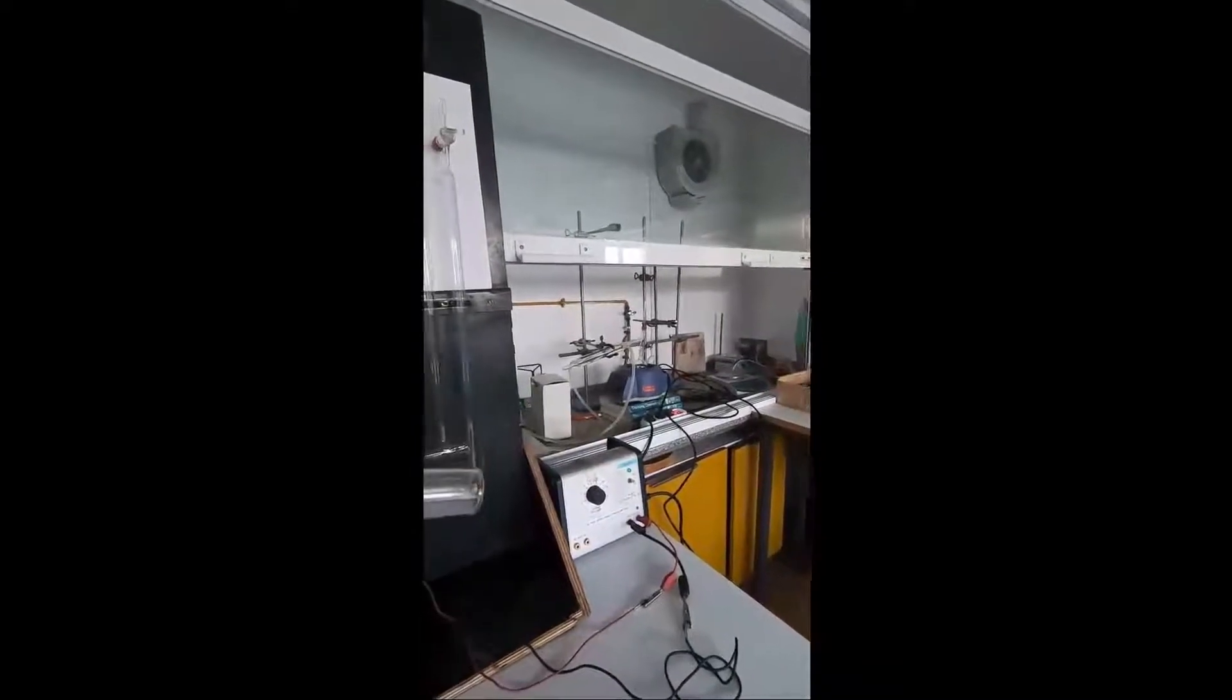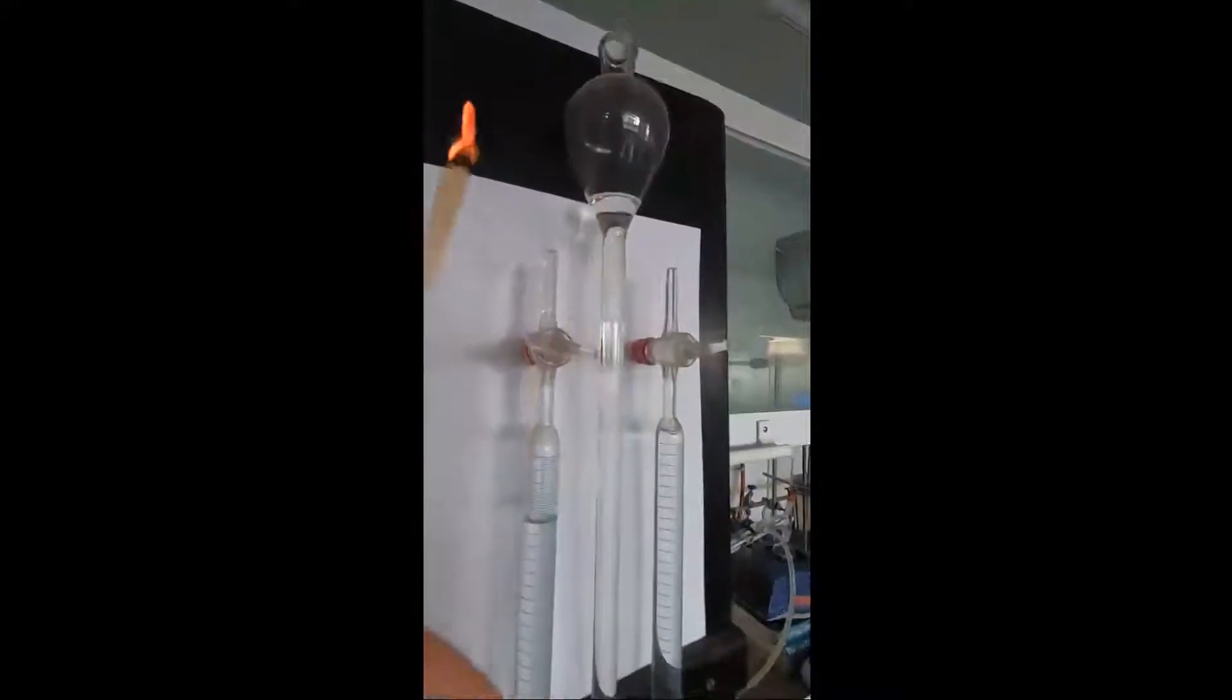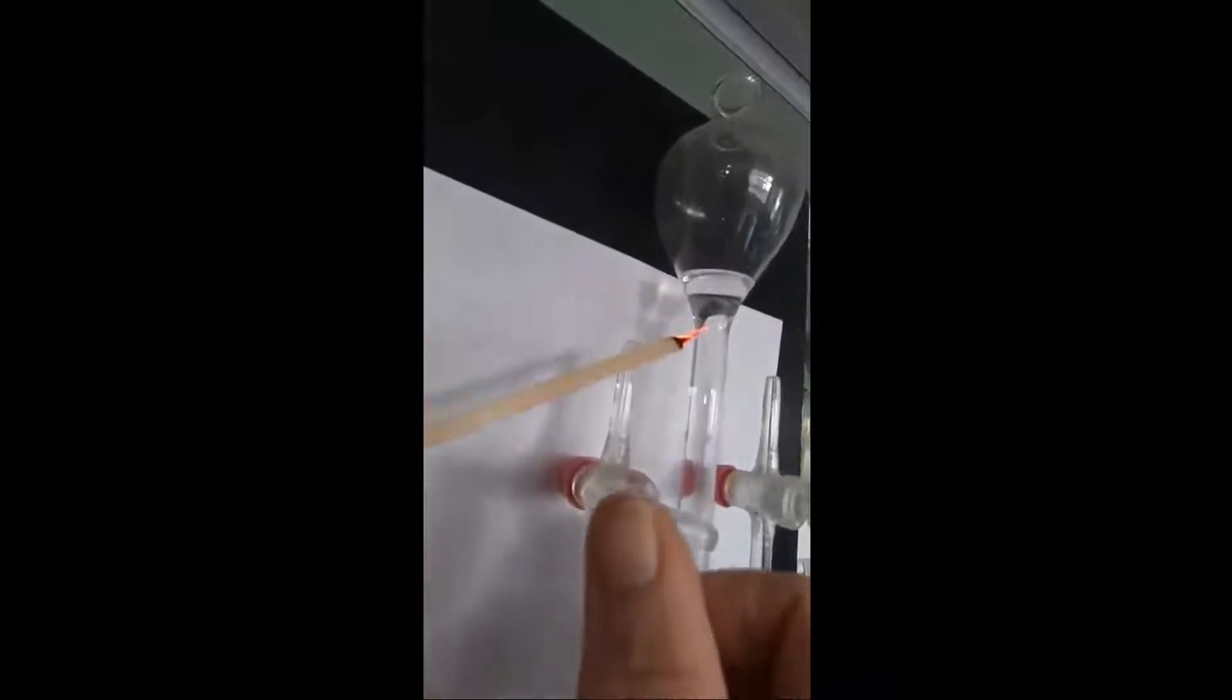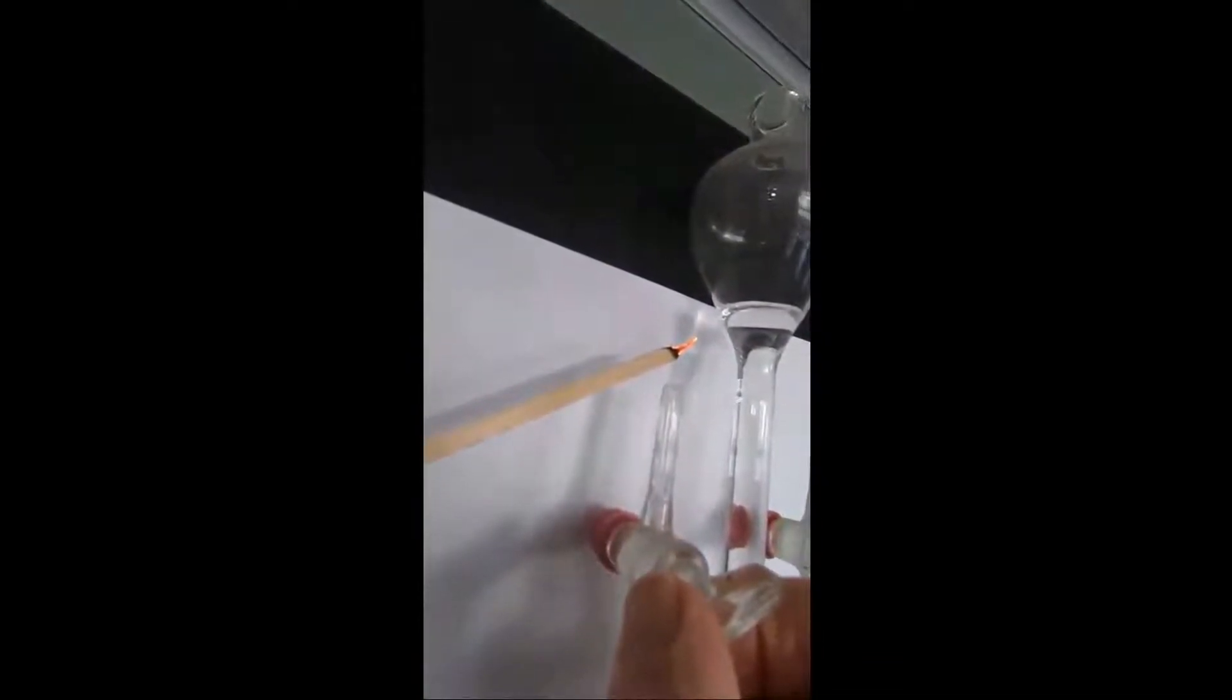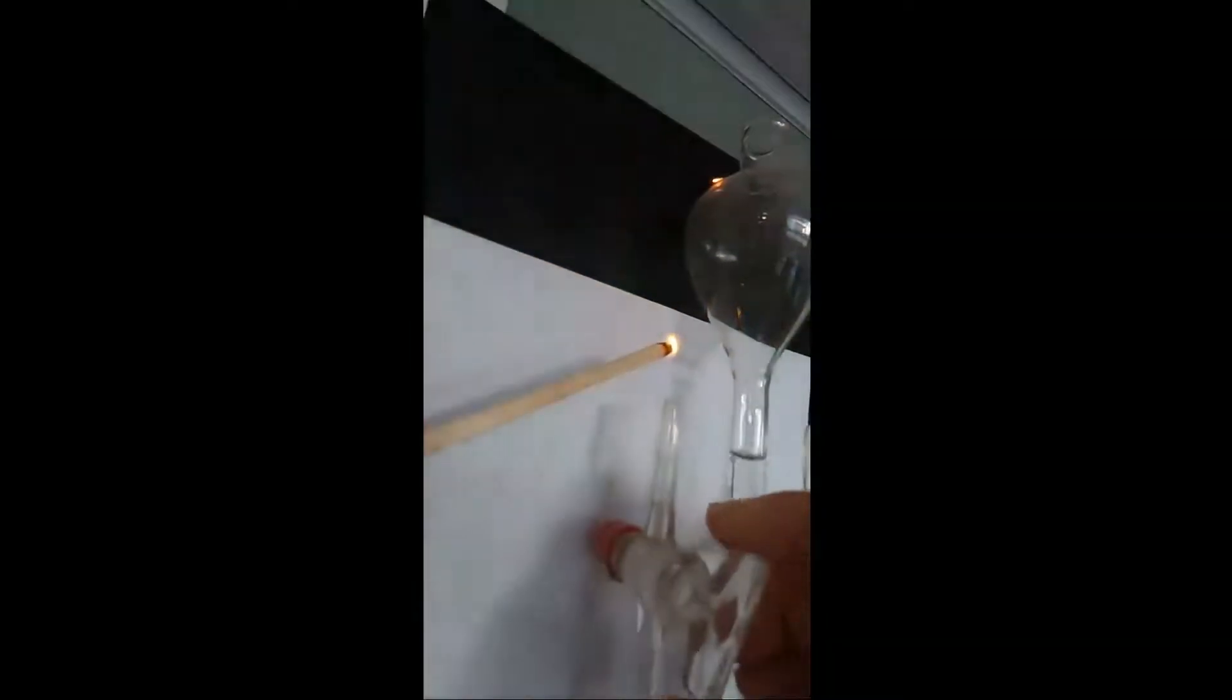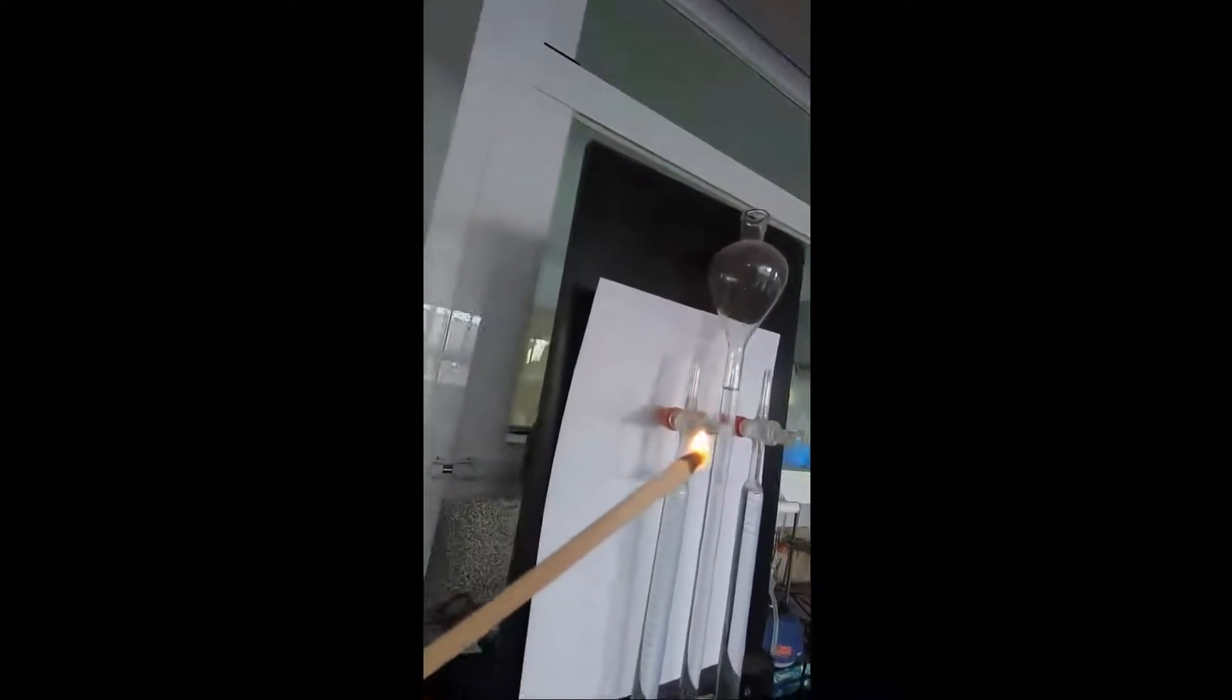We don't have very much of the other gas. I'm just going to blow out this splint and just hold it above the nozzle there. Let's see if we can relight it. Just open the tap—and the splint relights. When we relight a glowing splint, we know we've got oxygen present.